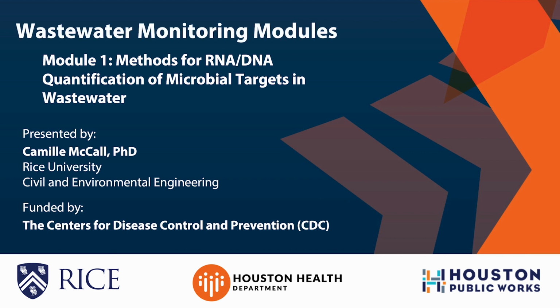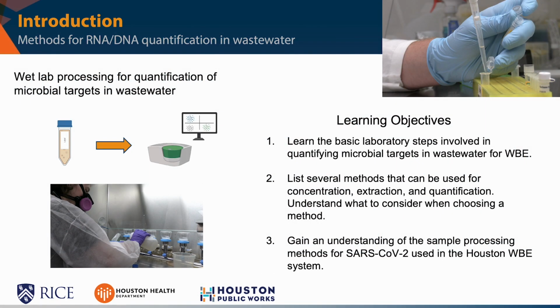I'm a postdoctoral research associate at Rice University working on the Houston Wastewater Surveillance Monitoring Program. This is the first module in this series on quantification of microbial targets. For this module, I'm going to be discussing different methods for RNA and DNA quantification of microbial targets in wastewater.